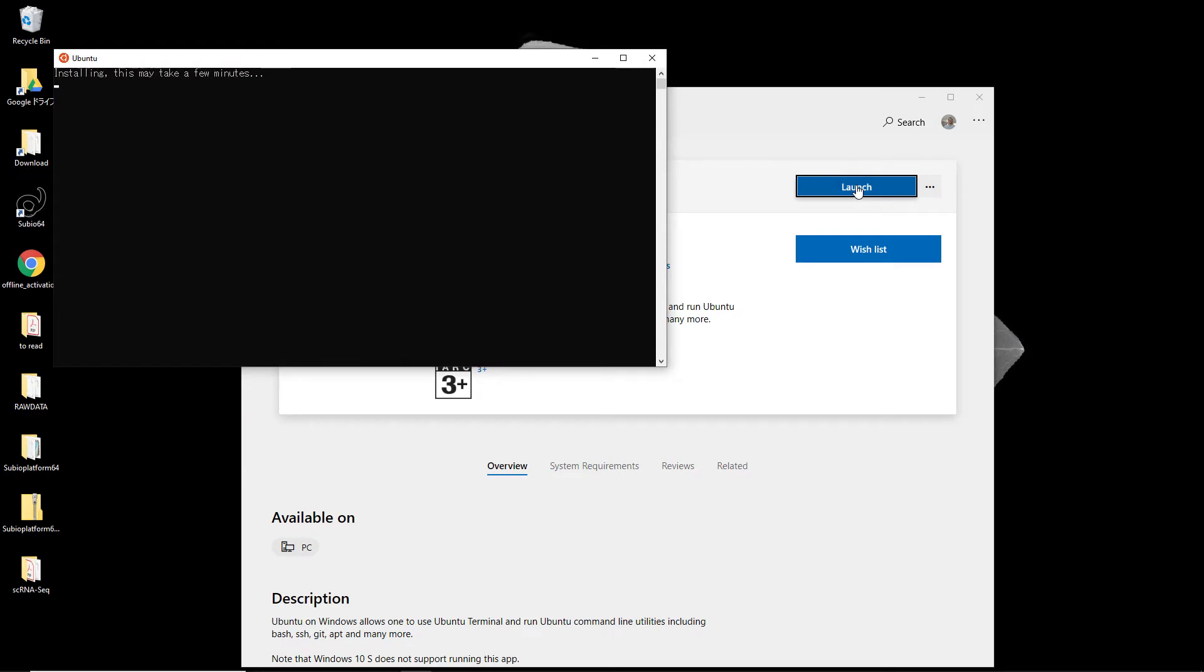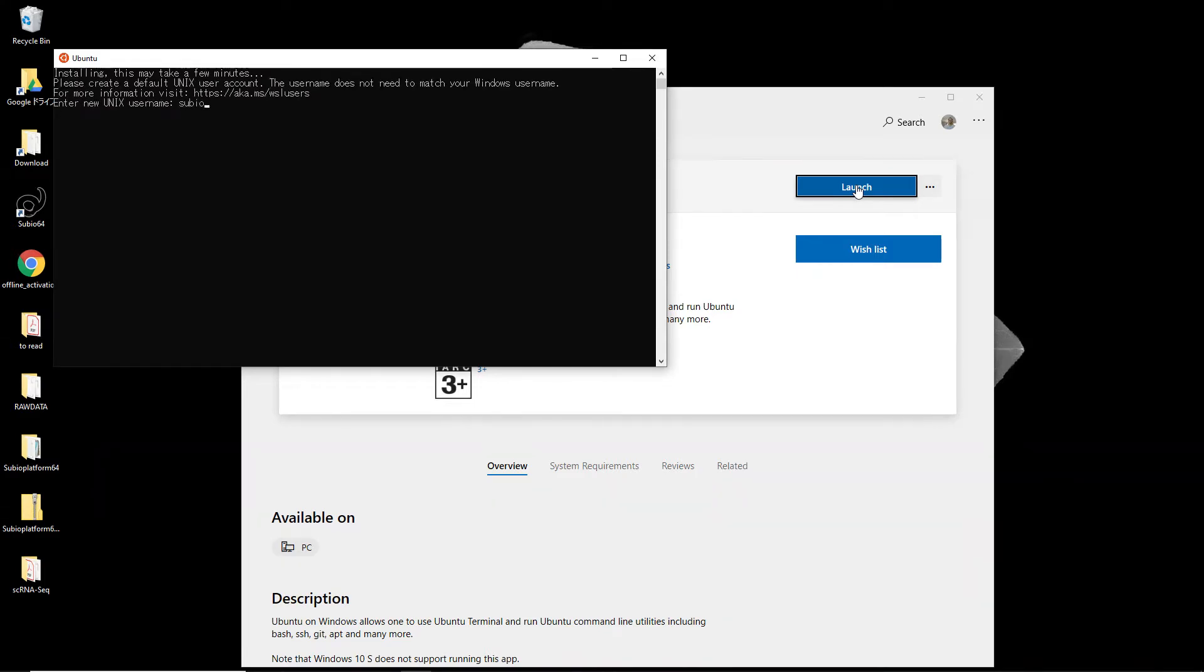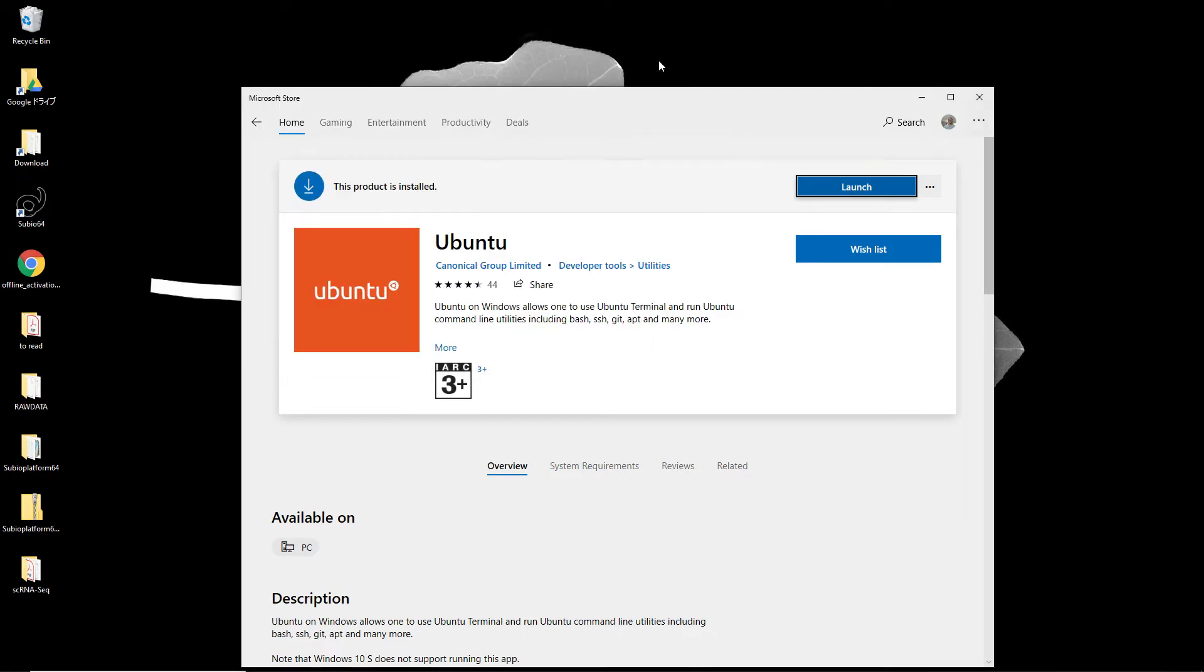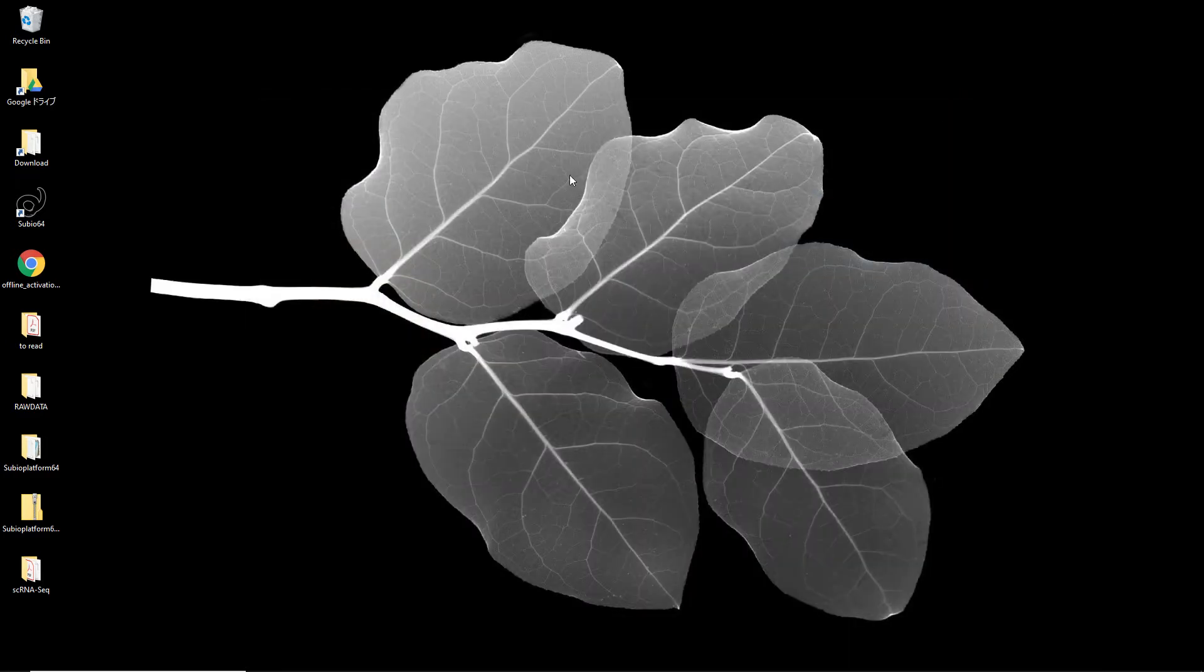Launch Ubuntu and set the username and password for the Linux system. Close the Ubuntu panel and launch the Subio platform.